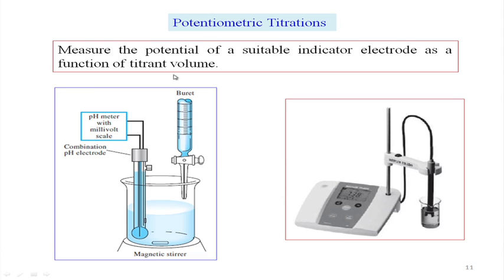And you go. The burette is clamped on the other side, the way we have clamped this. So, this will be clamped on the left and the burette will be clamped on the right, and you open up the burette and you have the solution, because your analyte is here now, and mixing of the analyte is also required. So, you put everything on your magnetic stirrer, and that magnetic stirrer will stir the solution with an incremental addition of a volume of the solution.